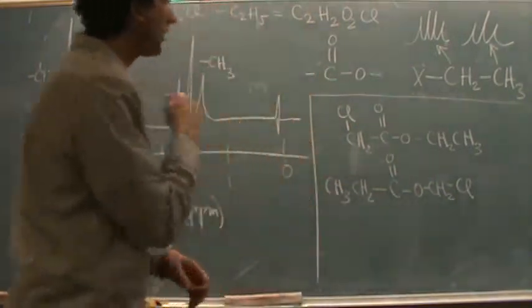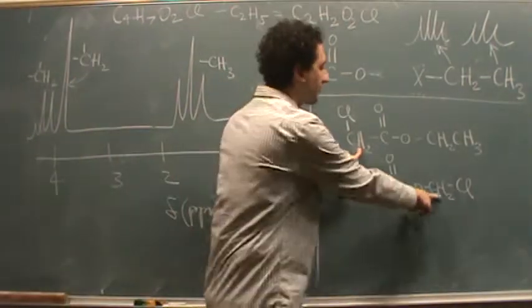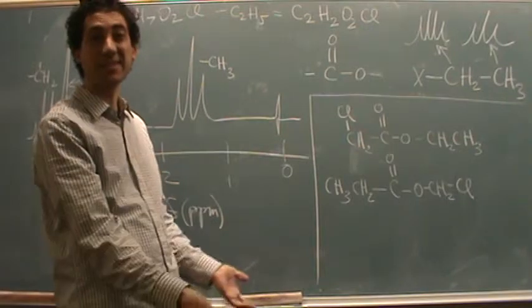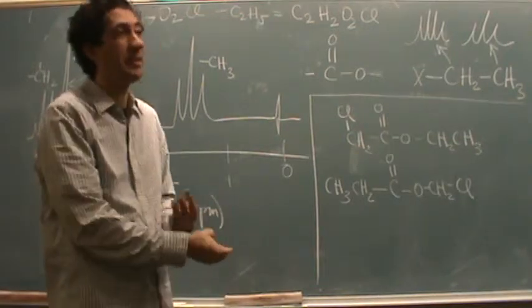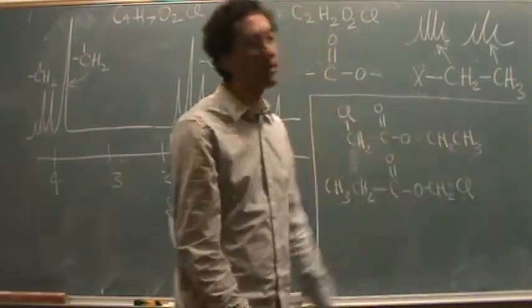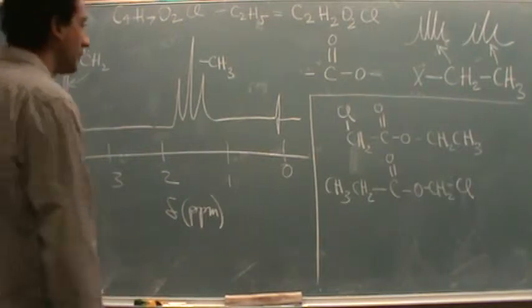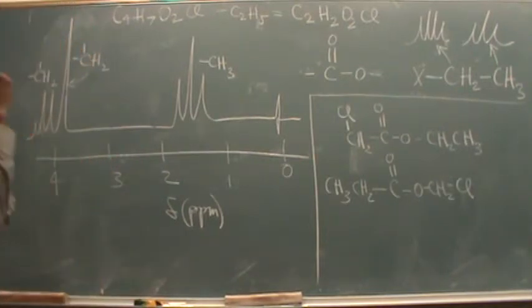I could do one of those 2 situations, because the CH2 by itself in either case would give the singlet because it's not next to anything, and singlet is the least amount of peaks you could have. This in either case would give the 3-4 peak splitting pattern. And in both cases, they have the right number of carbons, hydrogens, oxygens and chlorine. So everything's looking good so far. We just need to figure out which one it is.